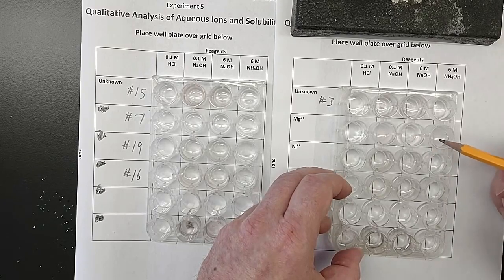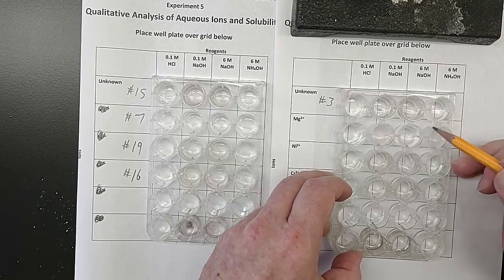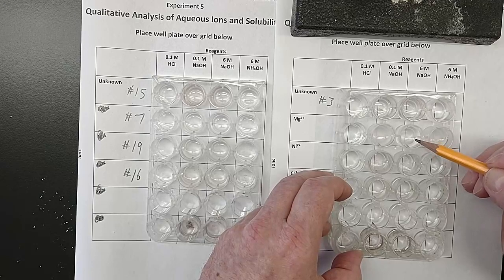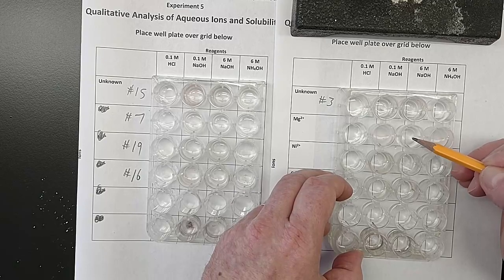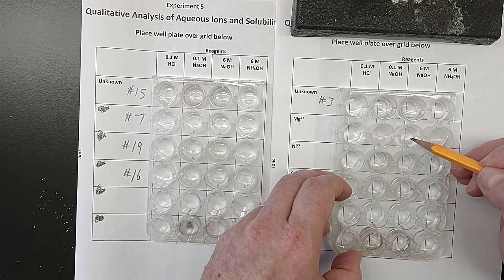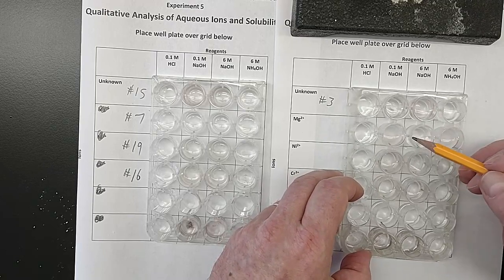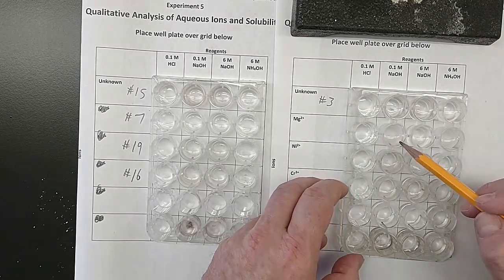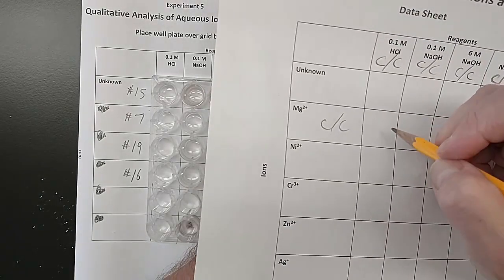Cloudy and white with the ammonium hydroxide. I can't see that line anymore. So I don't know why this one is a little bit lighter, but we could record that if we wanted to. This seems to be a little bit lighter, even though it's a more concentrated 6 molar sodium hydroxide. Okay, so cloudy and white, cloudy and white, cloudy and white. That's what I'm going to record in pen.